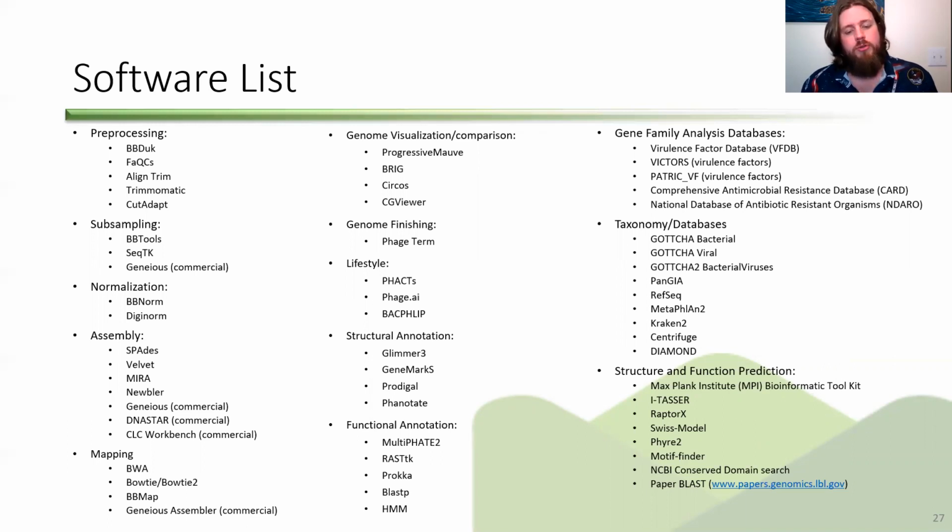Let's see. Do you select phages of different families of phages when you're making cocktails? No. We really only exclude phages based on how related they are if the sequence is almost identical or identical. The reason for this is that even a few SNPs can change how a phage binds.